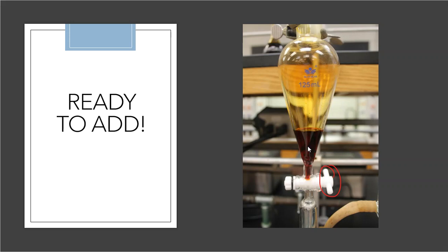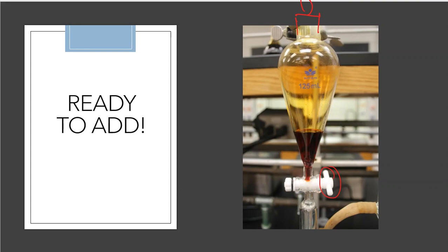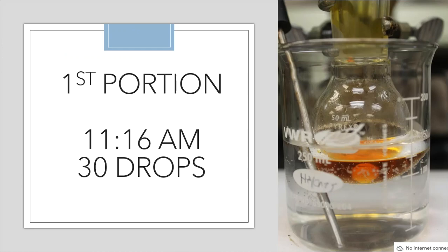In addition to this, though, there is a stopper up here on the separatory funnel. I want to quickly remove this when I add the drops and then quickly put it back when I stop adding the drops. Why? Because this will create some suction. And it's like your finger on top of a straw that's full of liquid. It does not come out. Folks, if you get to a point where you're trying to add solution through a separatory funnel and nothing is dripping out, it's probably because you still have the lid on it. So you need to take the lid off, and that way it will drip, drip, drip, just like it's supposed to. All right, so here's my first portion.